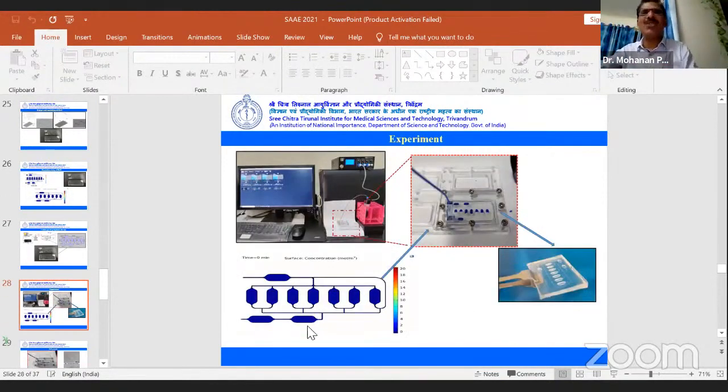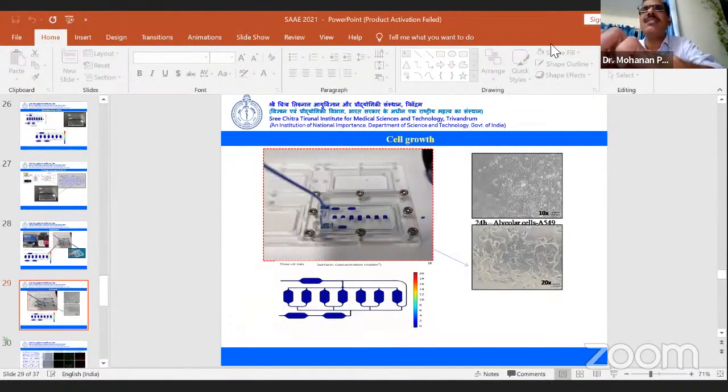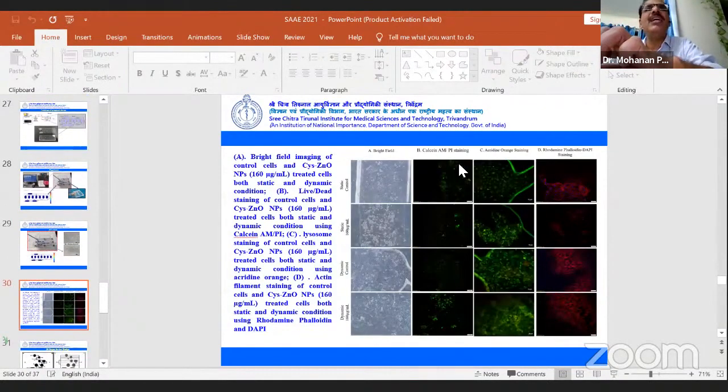This is also the same, like here also the simulation is there, but it's not working, I don't know why. So you can see here this flow. The flow is running like this. You can see the blue color, okay? Once the blue color reaches every organ, then it circulates. And here you have to do that. If the time is four, it's going to come. Then I can just run. These are the cells and all. And here you can see that we took the cells and did all the assays for this.